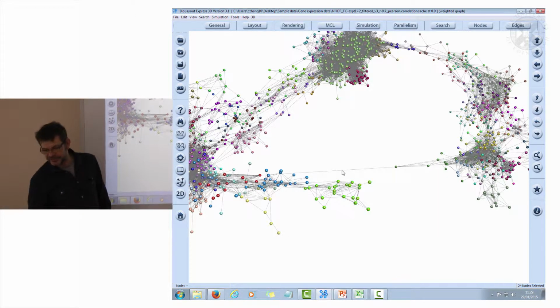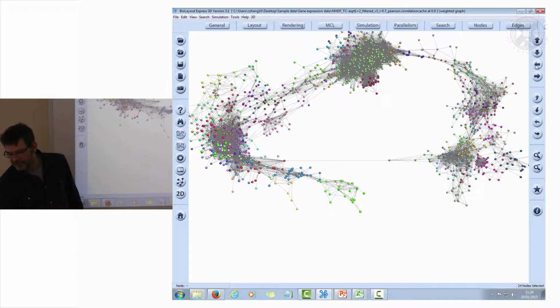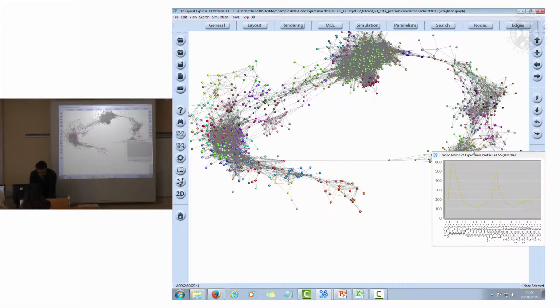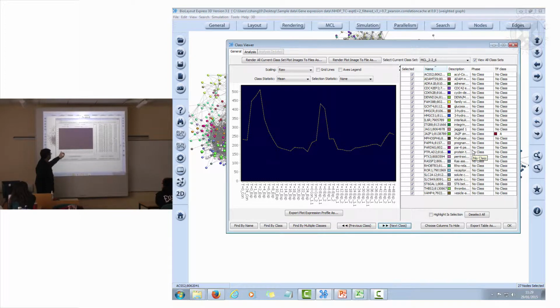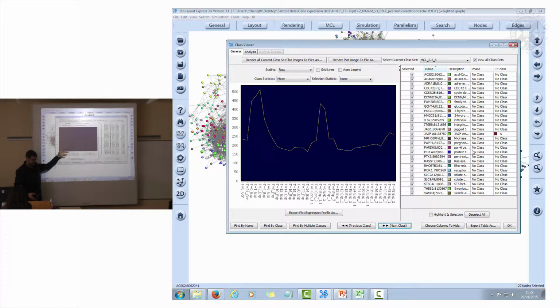So let's have a look at this graph in an overall context, because it allows you to understand what you've got here. We have all of these genes here. If we select some of these guys, these genes are higher in the unstimulated cells. At 0 hour, their expression level is highest. So these are things which are upregulated as cells go into quiescence. These are, if you like, your G0 proteins. These are things that keep cells from dividing. You'll find a lot of tumor suppressor genes within this collection of genes.